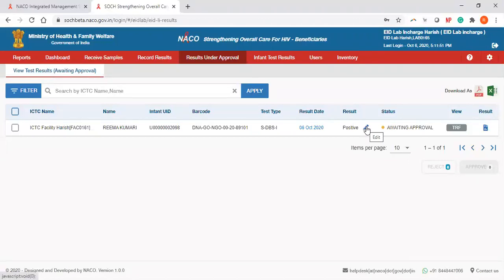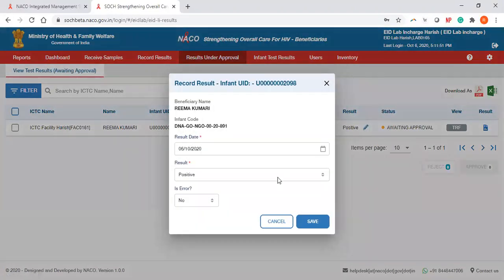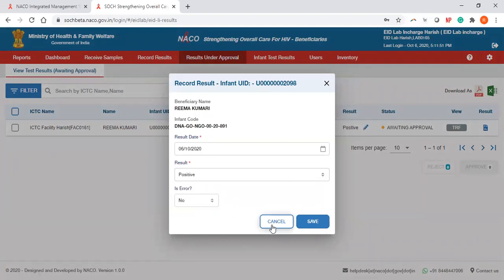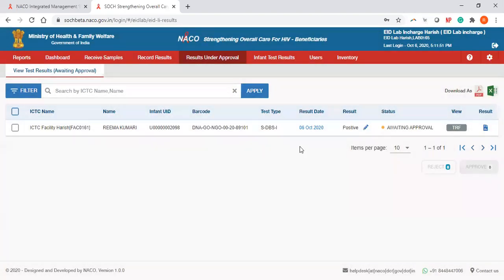Please note the EID Lab in Charge has the authority to edit the result at this point in time, so you can click on this and update it to negative or indeterminate through the lab in charge's account.